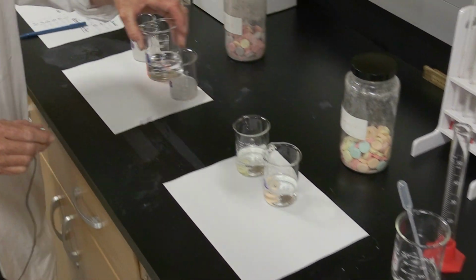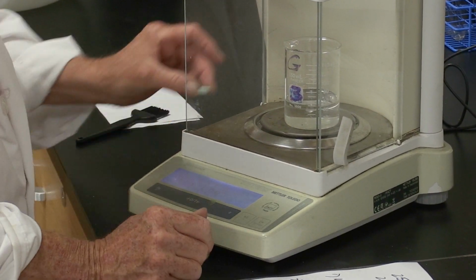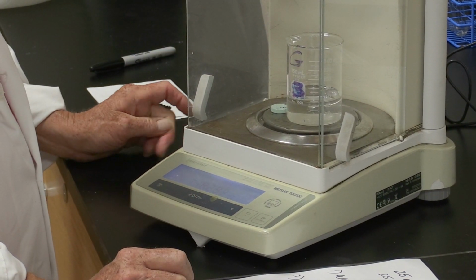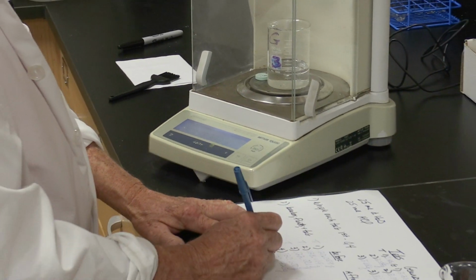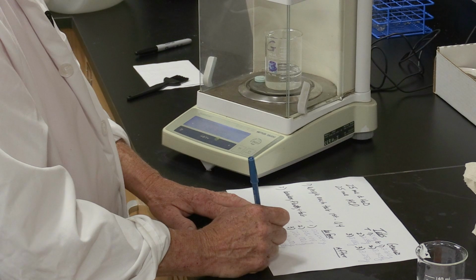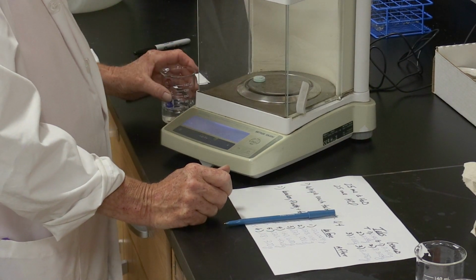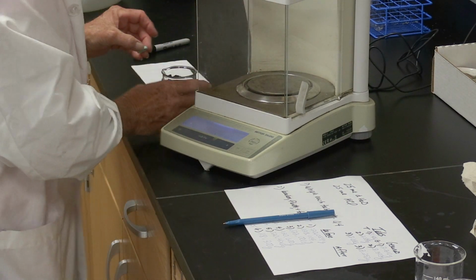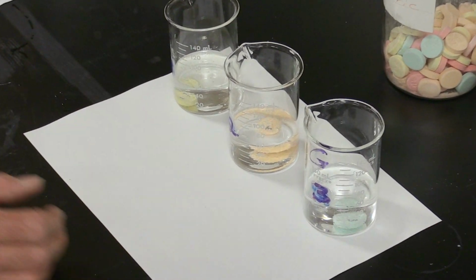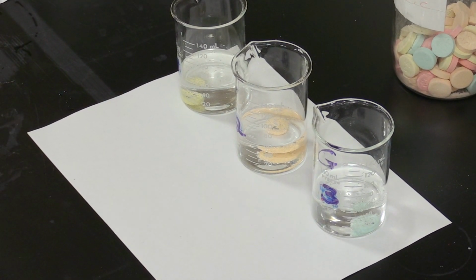And the last one of the generic, 118.300 grams. Okay, we'll drop the tablet in. And now we have to wait for all the CO2 gas to evolve.